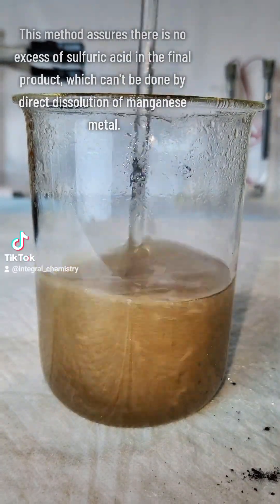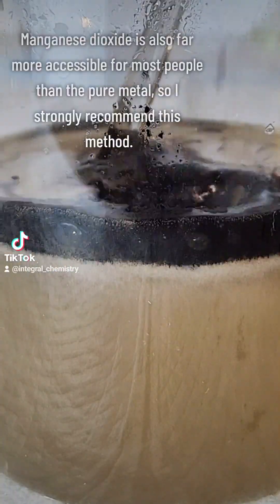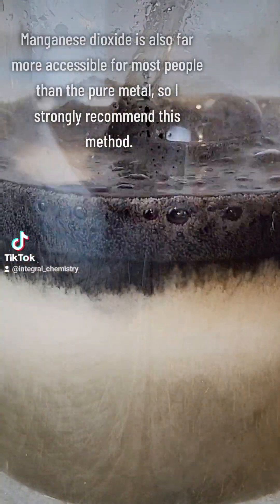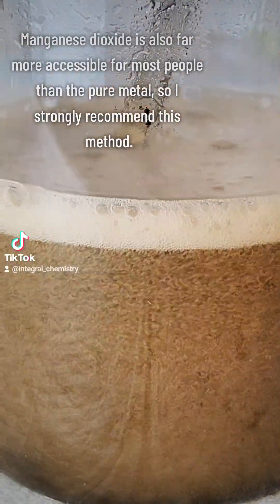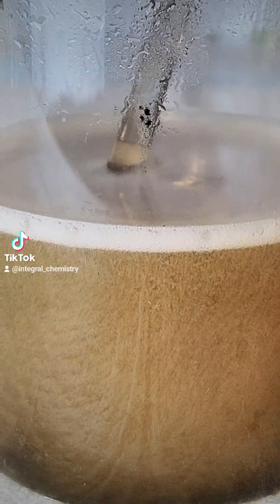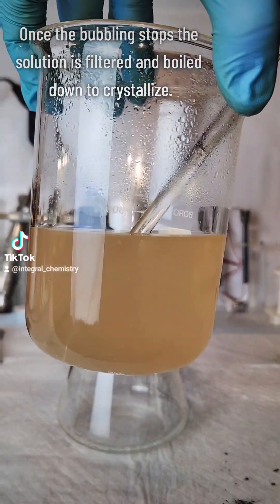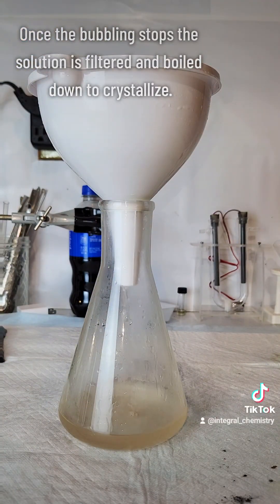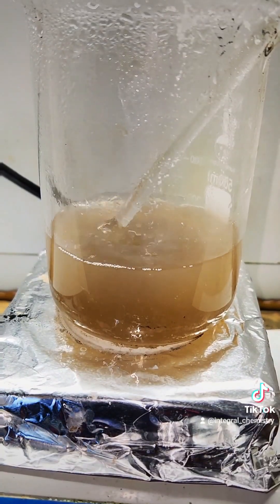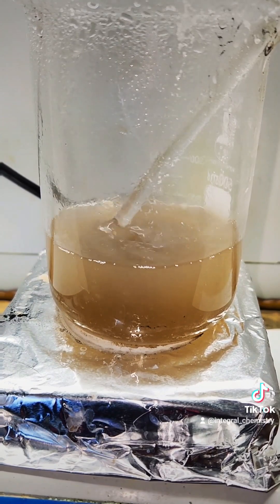I'll explain now why this is a better method than the direct dissolution of the metal. Unlike strong acids like hydrochloric acid or nitric acid, sulfuric acid is a better dehydrating agent and oxidizer than it is an acid. This means that sulfuric acid behaves more like a weak acid when reacting with metals, especially with its second hydrogen. Most metal oxides will react better with sulfuric acid than their metallic form, but the addition of oxalic acid creates a reducing environment that dissolves them even better.